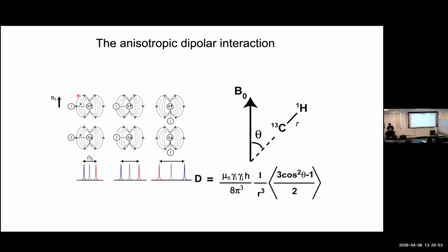Of course, solid state NMR can exploit that rich information. But how would you bring back the dipole interaction in solution NMR and make it measurable so that you can at least use it? What would be the approach? We've got solid state, we've got solution NMR. What do you have to do to bring back dipole coupling?